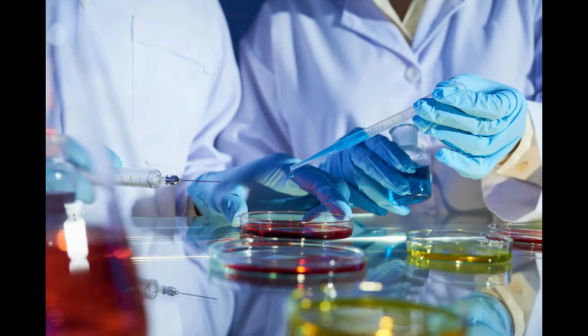A broth to a slant tube, so I don't know if y'all can see that in there, but I poured the agar at an angle, so you have a slant that you've got to transfer onto. And then this is called a deep tube, and we're going to write all that up here in a minute. But this one is just agar that goes straight across, and then you have a streak plate that we'll also do. So you'll have to be able to transfer your microbe.